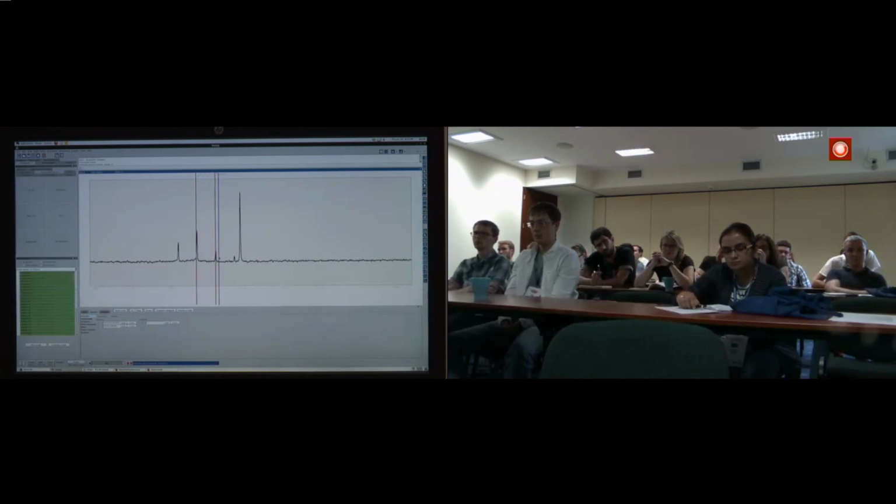And we would expect the rotational sidebands going farther away from the isotropic signal. So we would expect one signal being here, whereas on the other side, the signal, this rotational sideband, would go farther away towards the left-hand side.